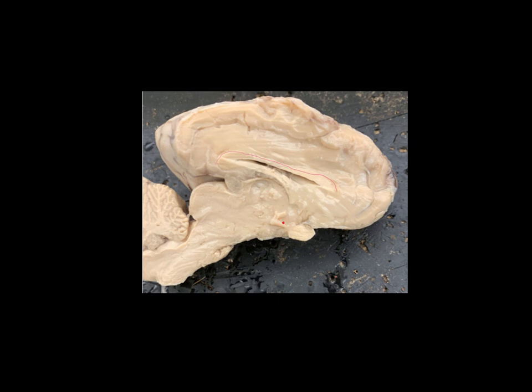Just below the thalamus, this area right here is called the hypothalamus. Hypo means below, less than, under — so the hypothalamus is under the thalamus. This is another one that's going to be really important when you get to Bio 139. Just underneath the hypothalamus, there are two structures. This structure right here — if we were able to flip this brain over, we would see that this is the optic chiasma, the point where those two optic nerves cross. Just behind the optic chiasma and directly underneath the hypothalamus is the pituitary gland. The hypothalamus and the pituitary gland are constantly communicating with each other to control your endocrine system.